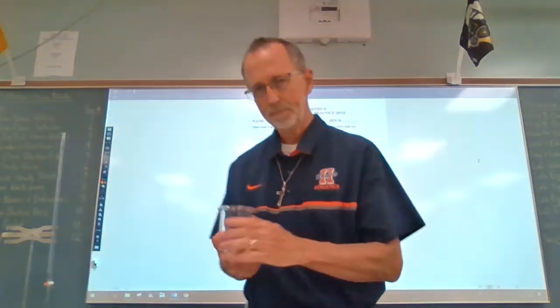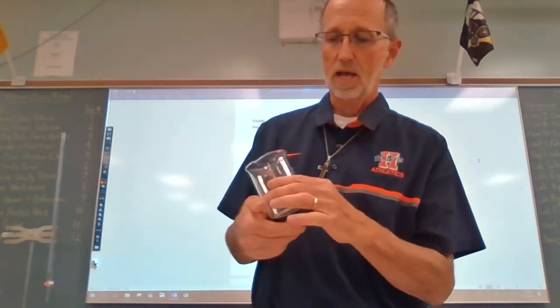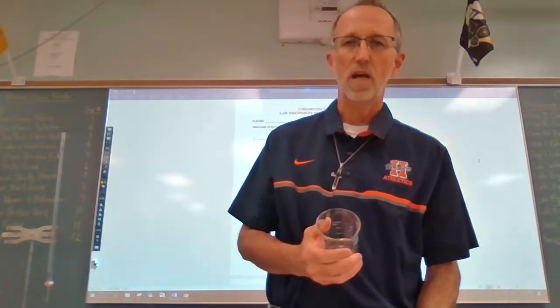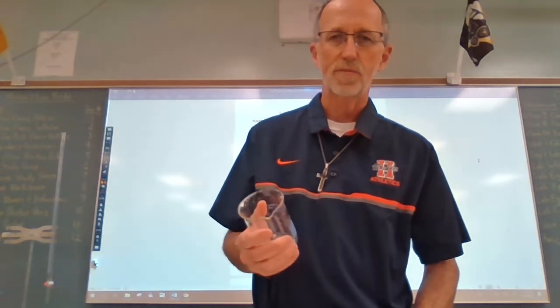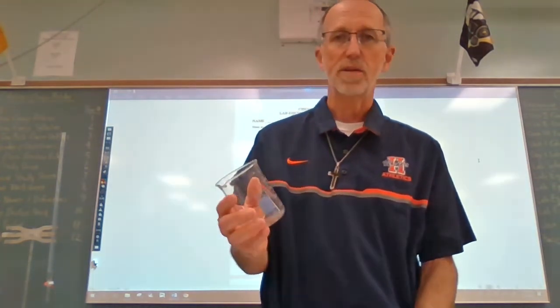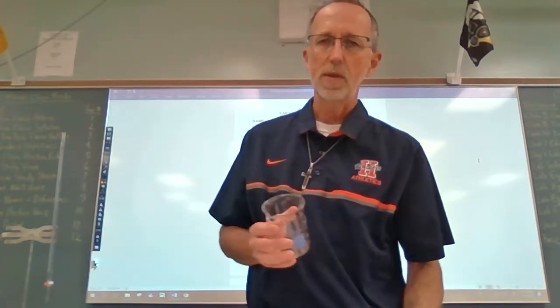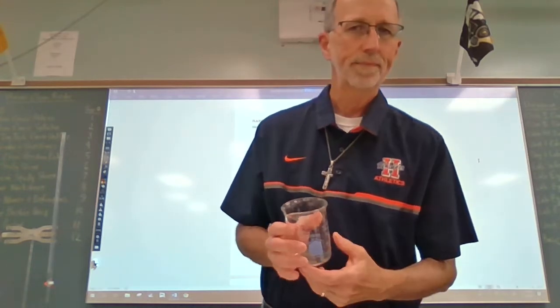Again, this also has volume measurements on it, but here again, there's no mention of volume measuring as a use for this piece of equipment, and indeed, we do not use it to measure volume. You can use it to approximate volume. If it says you need approximately 20 mLs of something, then you could use a beaker. But if you're measuring exactly, no way.